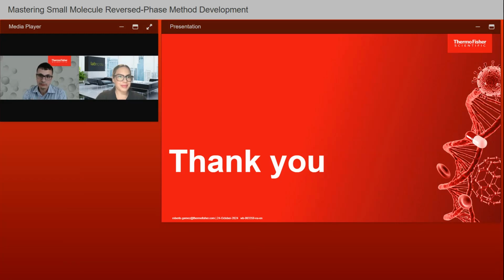Thank you. That's quite an interesting question. The way I see it, robustness and reproducibility go hand in hand. That can be done by analyzing the same sample under various conditions to determine the ability of the method to withstand variable conditions. What I mean by that is intentionally introducing variability into the actual method to see how that particular method will behave and how that variability can stress the method you're developing, to see how reproducible it is.